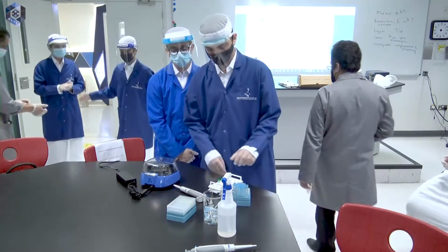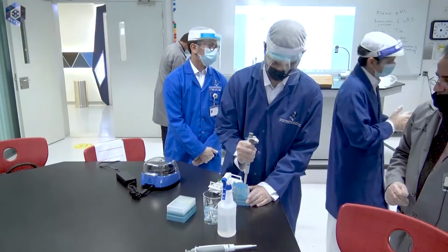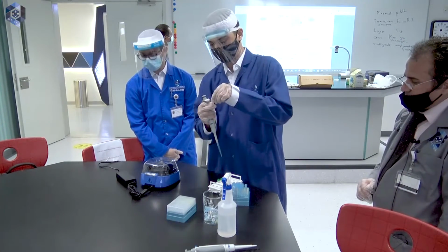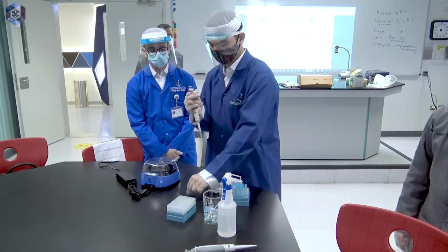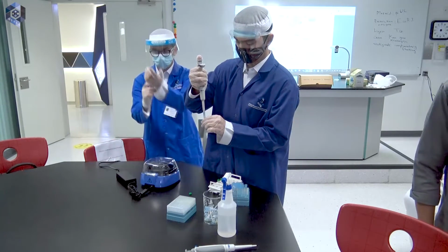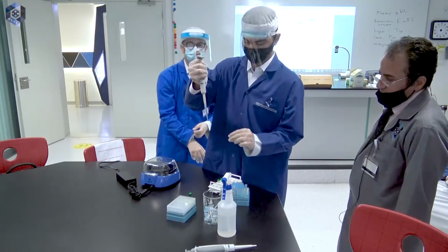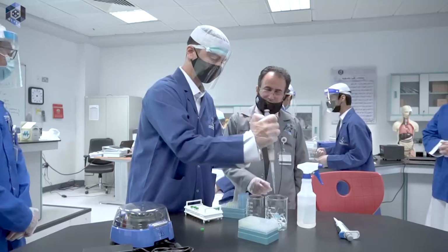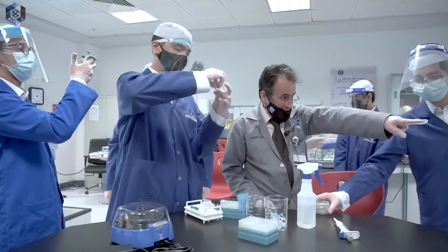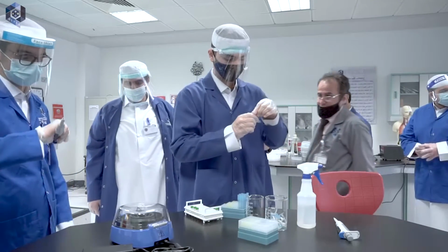Now for the other ones. Don't touch it with your hand. Get the Kanamycin plates from the tray, we will plate them. Close it. Next student. Anything related to the bacteria, we use this bench. Sterilize the bench because we are going to plate again right now.